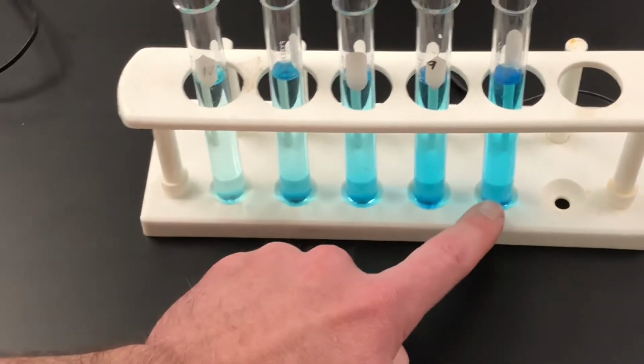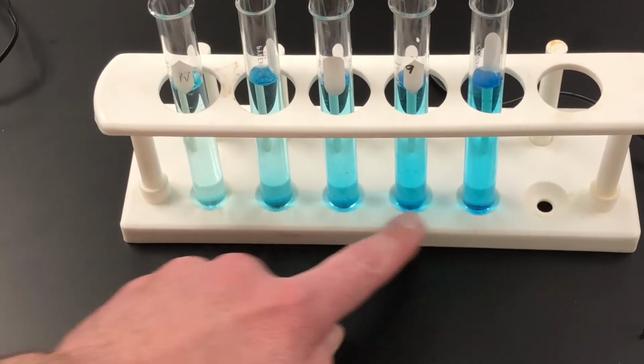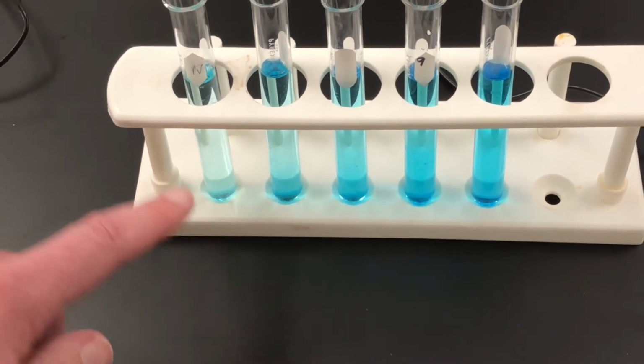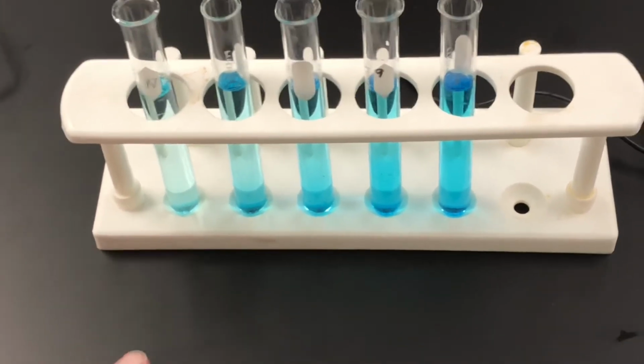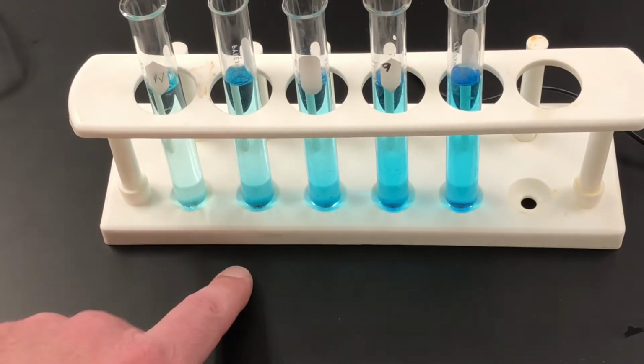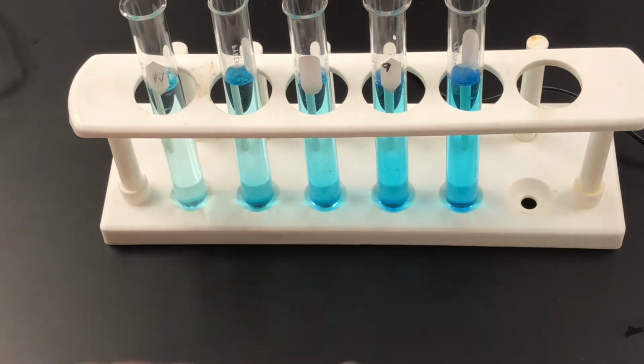This is the palest moving over here to the darkest. This is full strength, 10 milliliters of the 0.4. This is only 2 milliliters of the 0.4, and then I filled the rest with water, so it's going to be the most dilute. And it's going to be up to you guys to figure out what the concentration of each of these would be. So that is your first task.